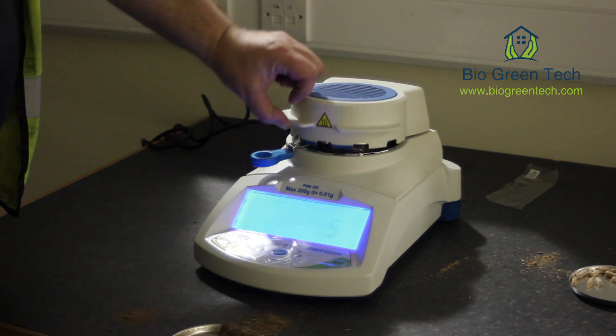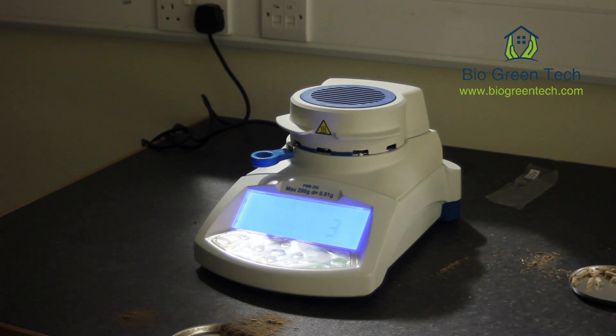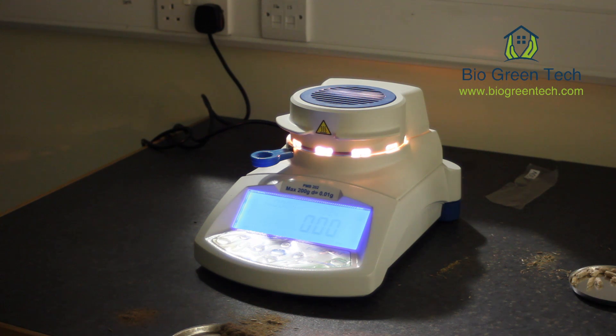It weighs the material and then it goes into automatic mode for doing the moisture analysis. It took a measurement of the material, heats it up for a set temperature and a set time which is all pre-set in the machine. It then switches off, cools down, measures it, and keeps doing that for a number of times. Then it will give you the exact moisture which is in your material.